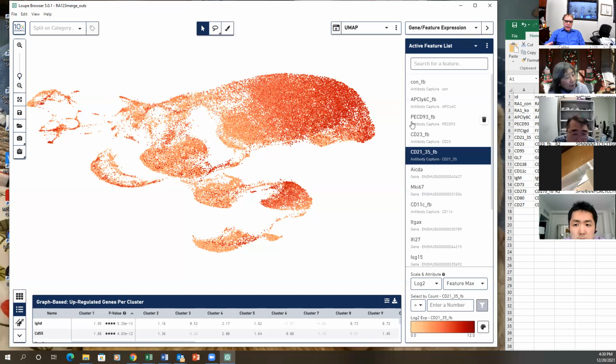They're signaling and they're active. And then if they don't make it, they get parked over there to the right. Those are kind of inert. But okay, so that's IgD of the antibody. No, this is CD21. So I think marginal zone here, FO, follicular B cells here, transitional B cells here, and germinal center here.